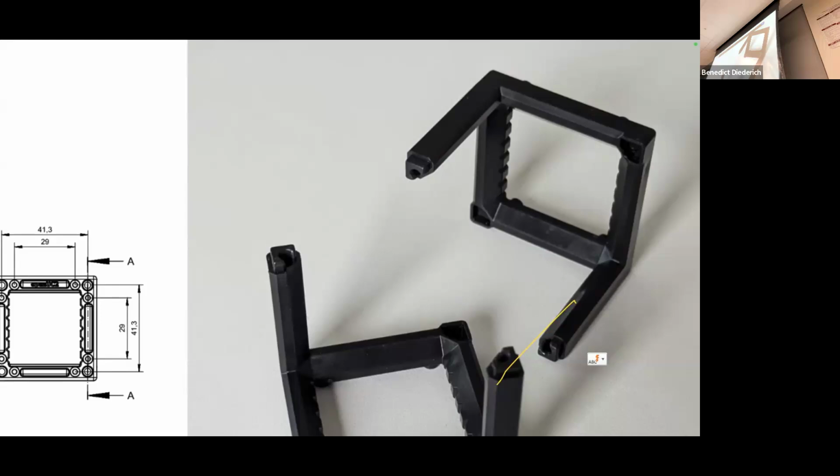What you have in the end is 8 holes and 8 pins, and they interact with each other to make a stable fit. I think you probably know from Lego, I mean, Lego is an exception, but that's not very smart, because mechanically over-defined systems are typically very unstable, which is the case here. It's also very hard to print because the tolerances are adding up. So either you're too big or too small.